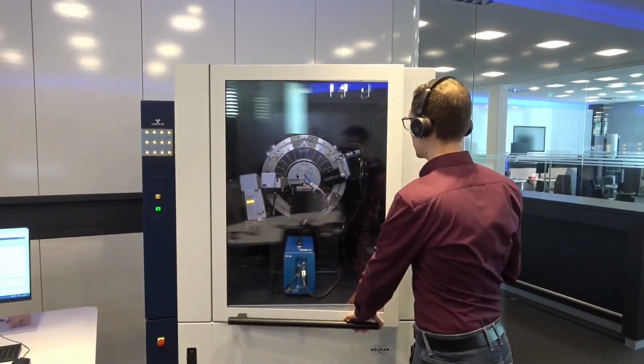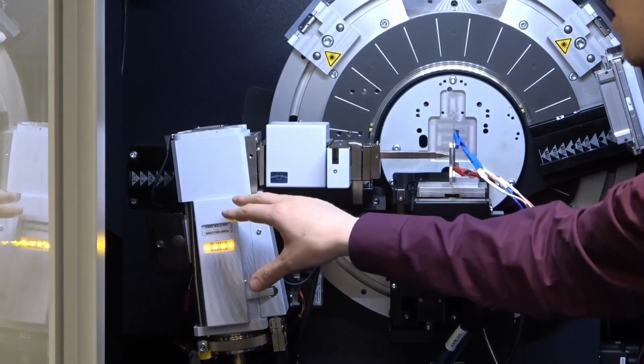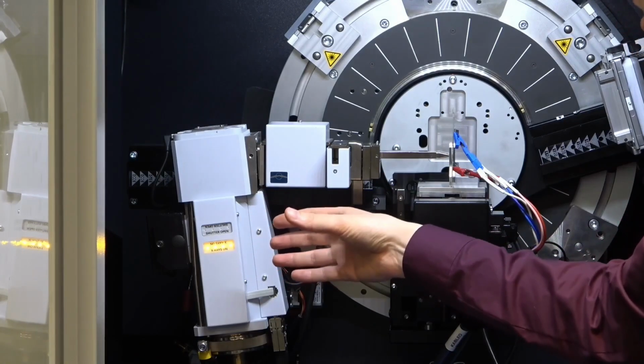Let's have a look. In this system, I'm using a molybdenum tube on the primary side, which has a high intensity and a rather short wavelength compared to copper. This will allow us to catch more diffraction signals in a smaller 2 theta range.